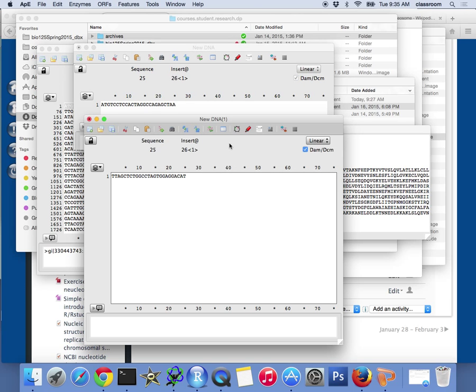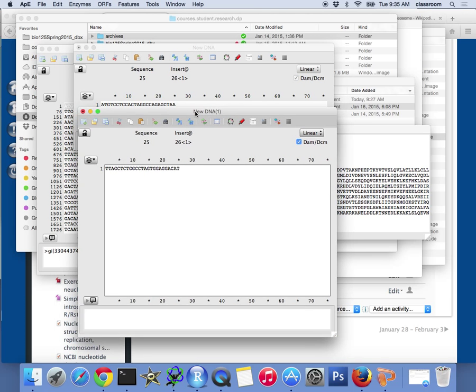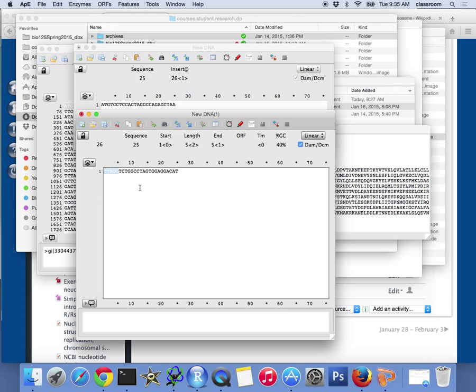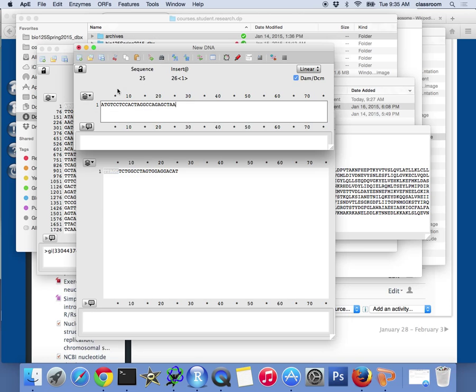The two strands are reverse complement of each other. So I have TTAGC. I'm going to verify the end sequence.